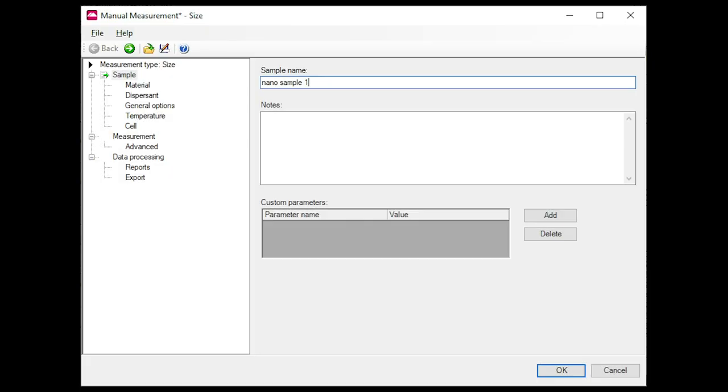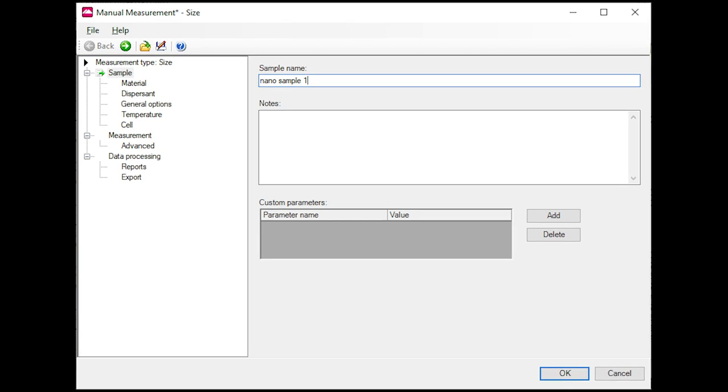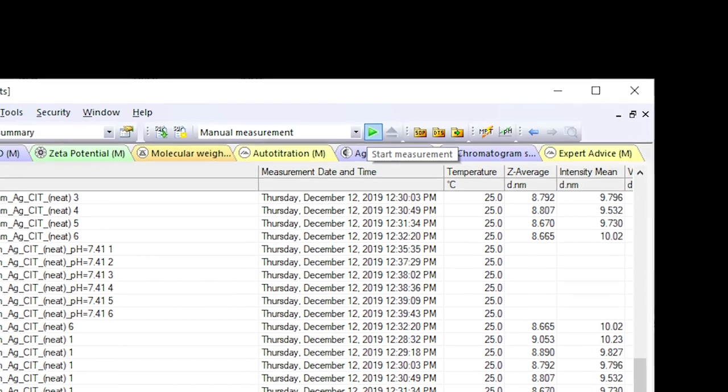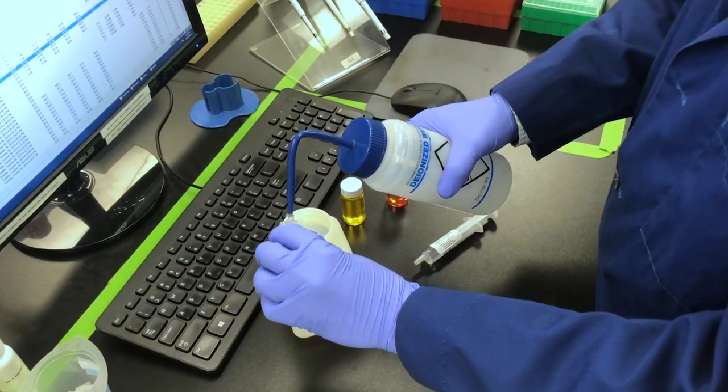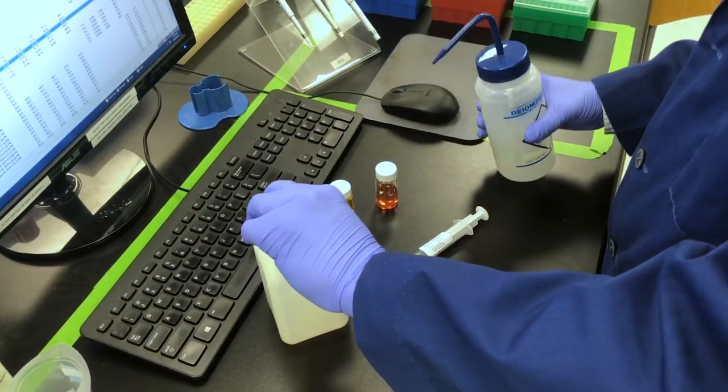Within the instrument software suite, navigate to the SOP of interest or manually configure the measurement as necessary and press start to begin your measurement. Measurements can often take more than a few minutes, so be sure to return and claim the zeta cell afterward by draining it of sample and then rinsing with deionized water.